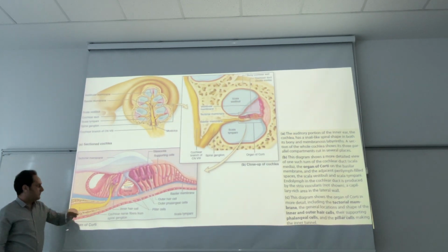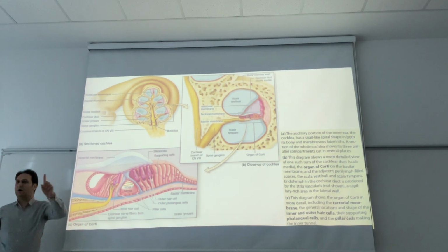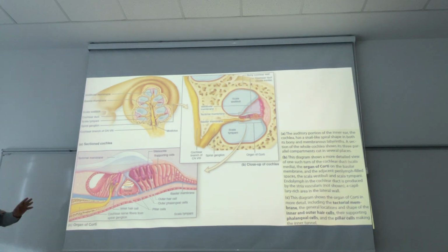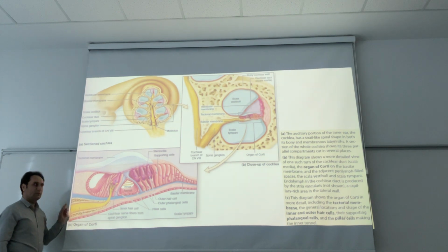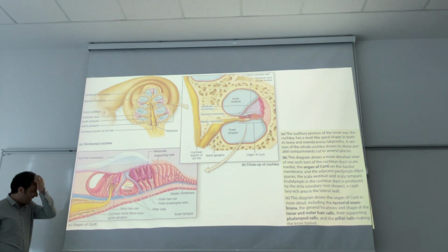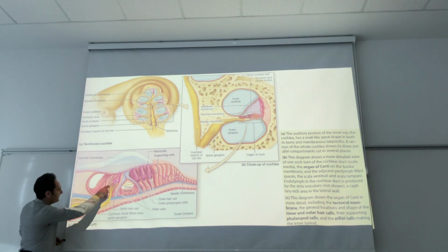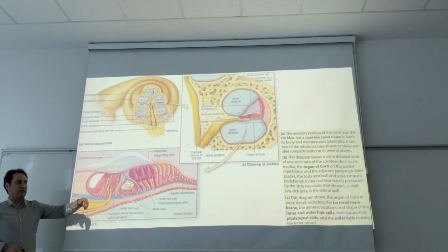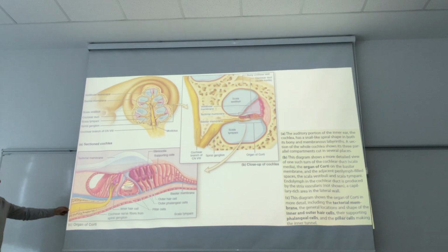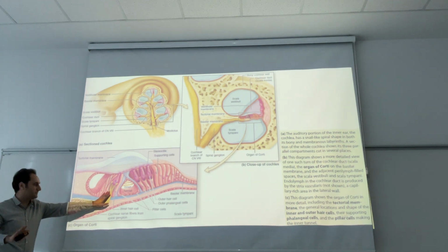From the inner sulcus, here we have the inner hair cells. Only one layer of inner hair cells is present on the inner side, connected with the nerve fibers and supported by phalangeal cells. In this part we have pillar cells which support these inner cells, inner pillar cells. Sorry, inner phalangeal cells, not pillar cells, but inner supportive cells.